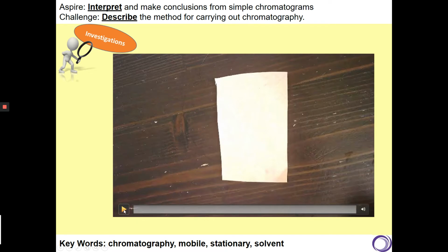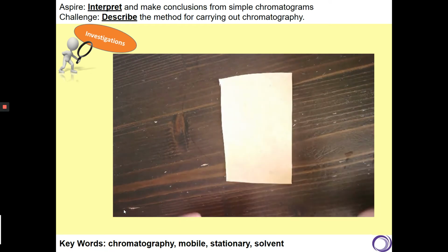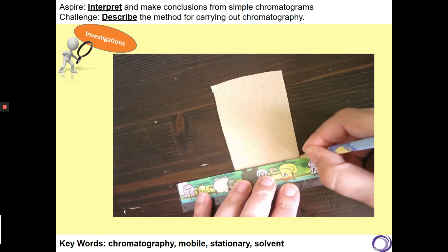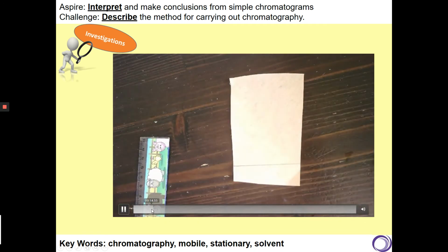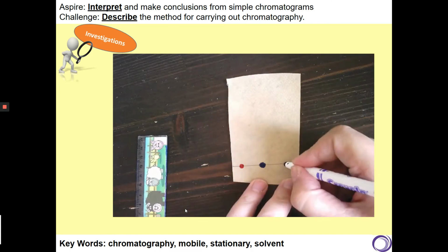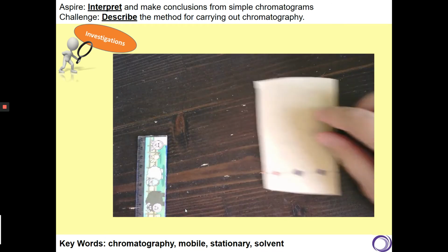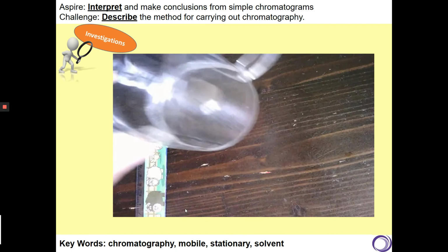And I drew a dot with a red pen. I then drew a dot with a blue pen. And I drew a dot with a purple pen because I thought, well, purple, we make it from blue and red. I then put the piece of filter paper in some water, about 50 millilitres of water, but if you didn't have a beaker with a measurement on it, it's about 1 finger depth.